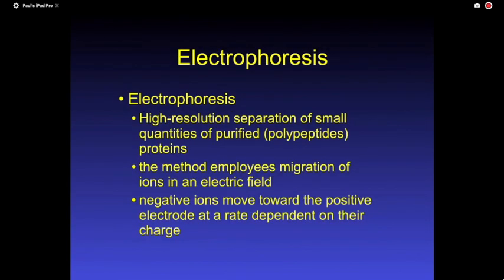All right. The chromatography techniques. Here's the deal. I don't know of one purification scheme that gets your protein pure using one single step. Okay? Most of the time, it's multiple steps to get a pure protein. How many steps it takes depends upon the complexity of the mixture you start with and the competing things.